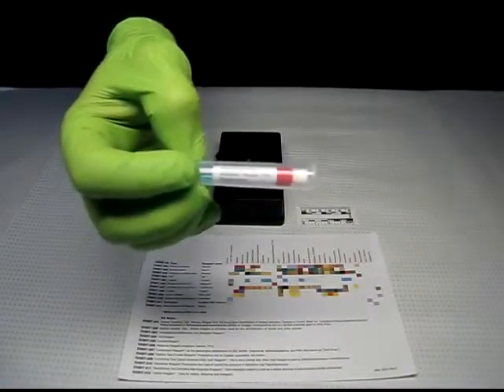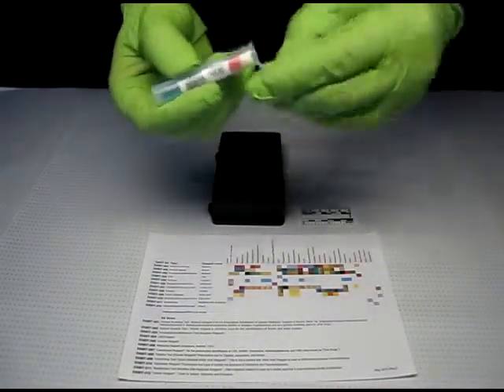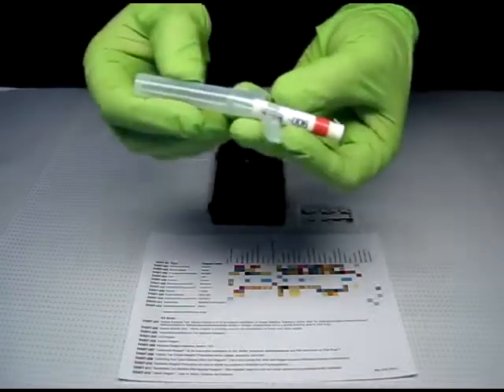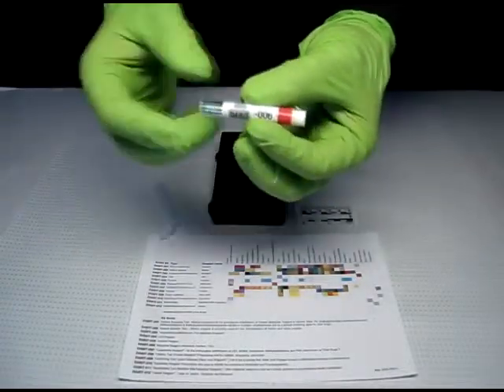Here we are demonstrating the DABIT 006 Marijuana Test. Remove the sampler from the clear outer tube. Remove the protective paper from the sticky sampler tip.